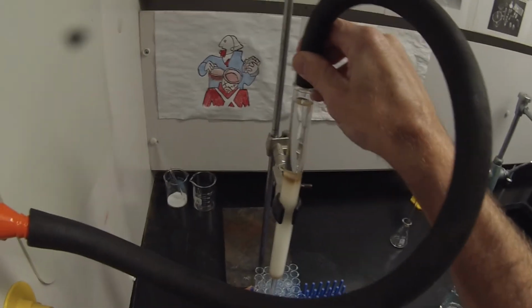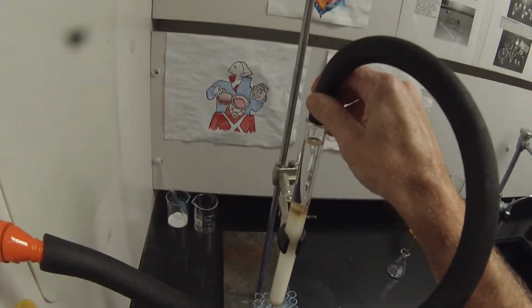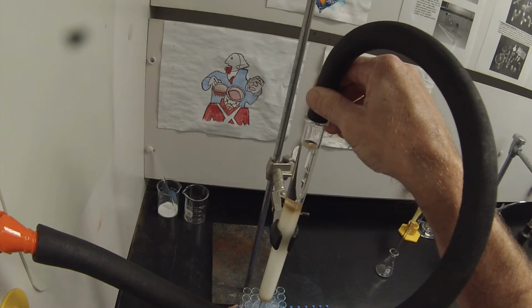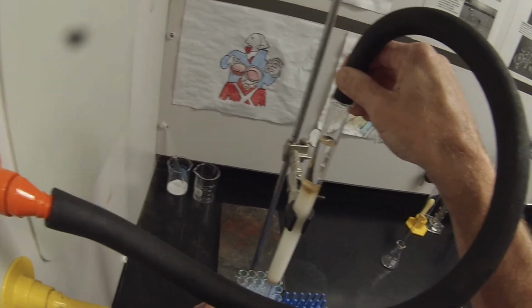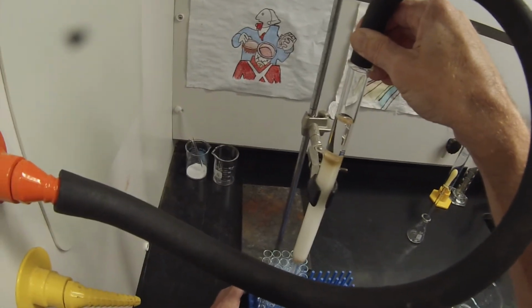Often you'll run a step gradient if you have two compounds that are fairly different in RF. You saw that one paper where they used dichloromethane and then they used some dichloromethane methanol mixtures. Right, so they take the nonpolar stuff off first and then they increase the polarity of the eluent to try to get the more polar things that are sticking to the stationary phase.